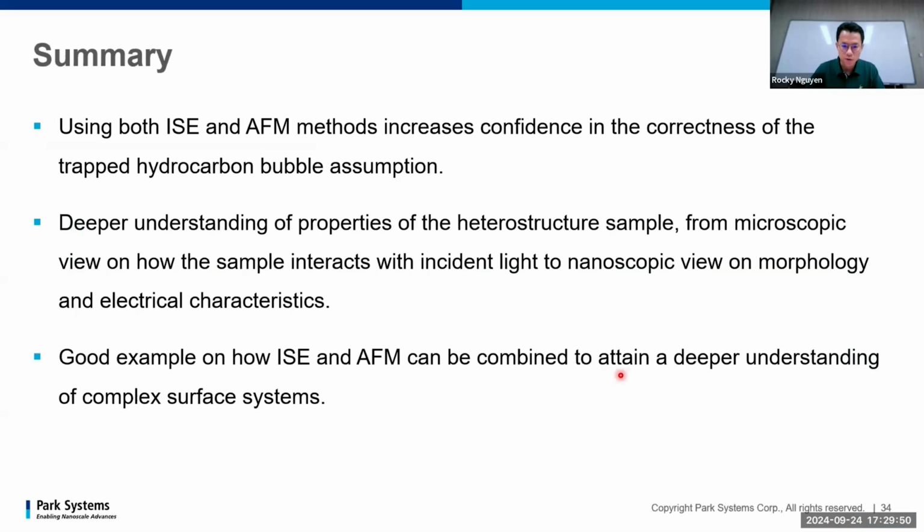And also the results allowed a deeper understanding of the properties of the heterostructure sample, from the microscopic view on how the sample interacts with the incident light to the nanoscopic view on the morphology and electrical characteristics of the sample. So we believe that this synergistic combination of SE and AFM can allow a deeper understanding of complex surface systems.